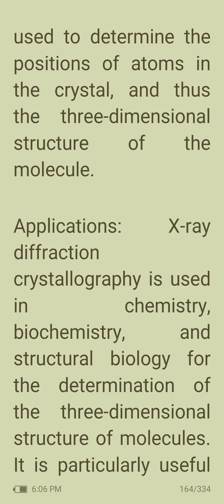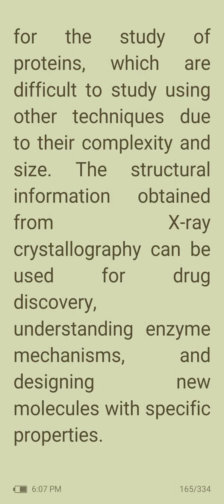So, which are the applications? X-ray diffraction crystallography is used in chemistry, biochemistry, and structural biology for the determination of the three-dimensional structures of molecules. It is particularly useful for the study of proteins, which are difficult to study using other techniques due to their complexity and size. The structural information obtained from X-ray crystallography can be used for drug discovery, understanding enzyme mechanisms, and designing new molecules with specific properties.